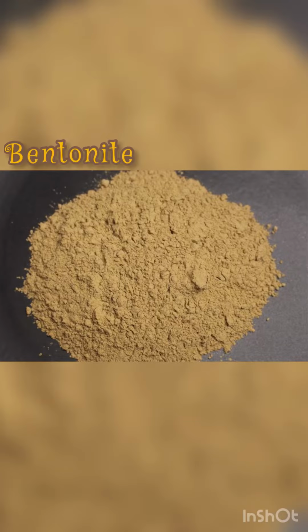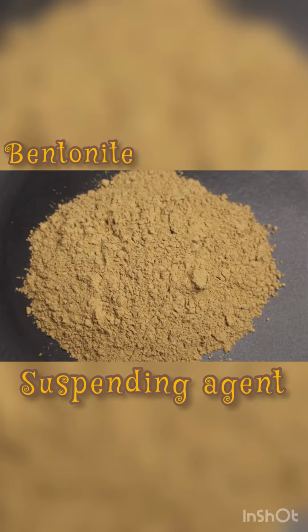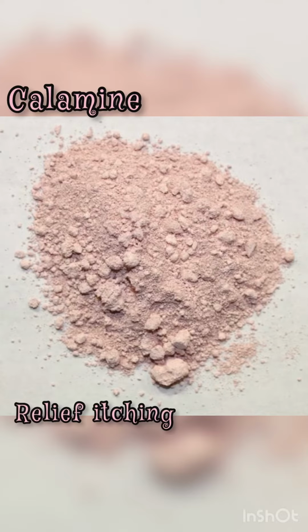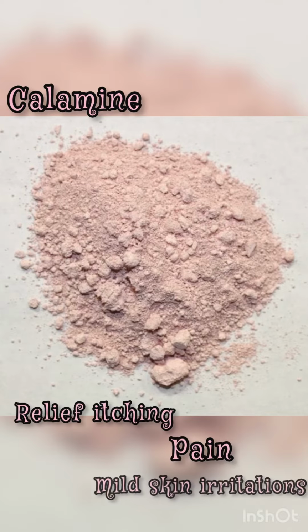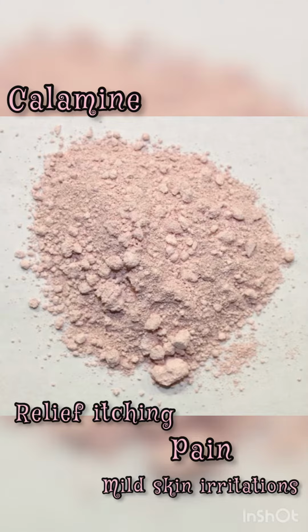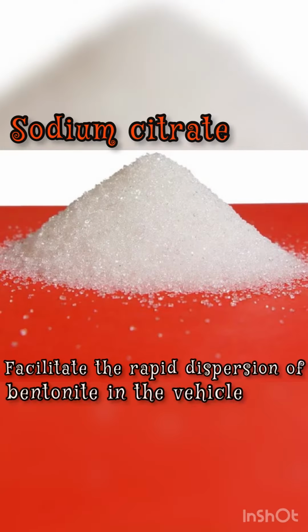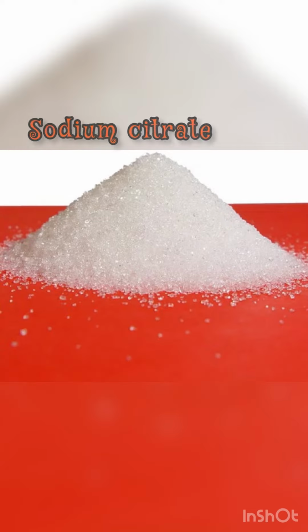To make the calamine lotion, we need the bentonite, which acts as a suspending agent. Calamine, which is our active ingredient, is used to relieve itching, pain, and mild skin irritations. Sodium citrate can be used to facilitate the rapid dispersion of bentonite in the vehicle, which is water.